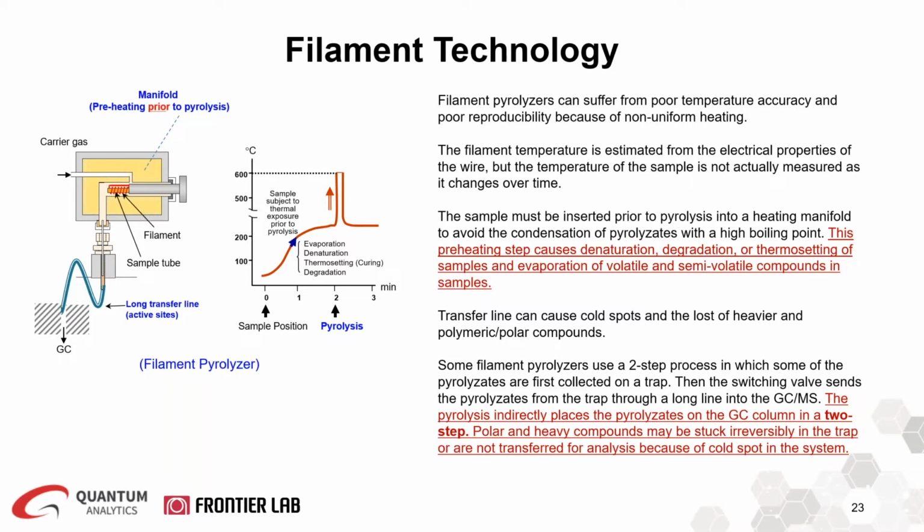The sample must be inserted prior to the pyrolysis into a heated manifold to avoid condensation of the pyrolysates. And this preheating step causes degradation or thermosetting of samples and evaporation of volatiles and semi-volatile compounds in the sample prior to your analysis.